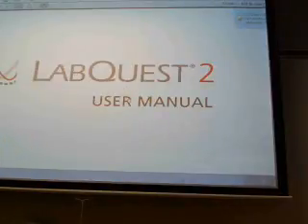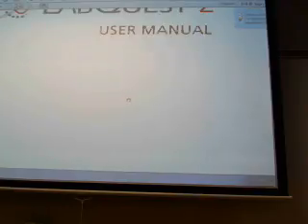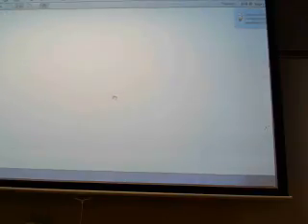All right, this system is brand new, LabQuest 2. This is the user manual here. Let me scroll down. Yeah, we're going to use the graph. We're going to plot this one.